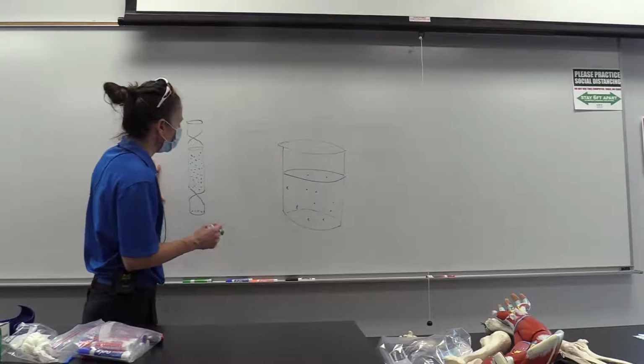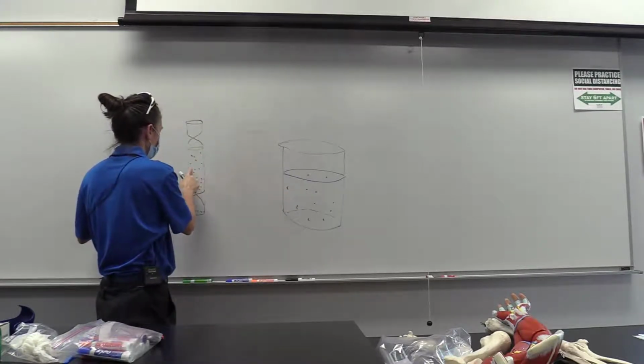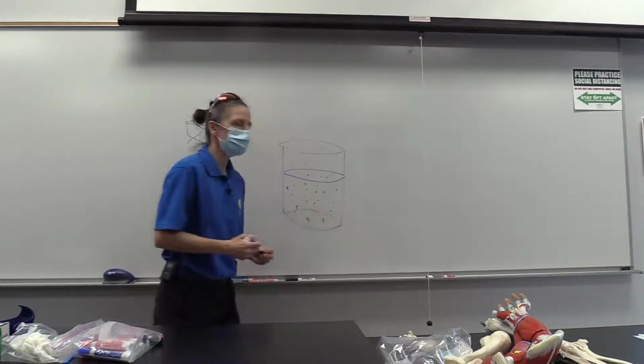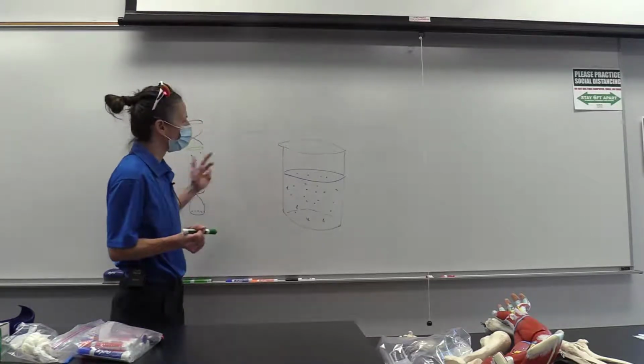If you do the reverse and start off with the methylene blue dye in the beaker and not in the bag, and then you leave the bag in there for an hour, what happens? The bag turns blue, exactly.